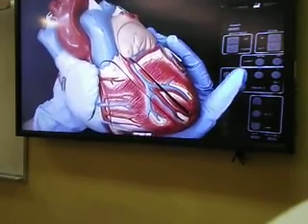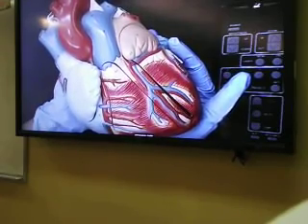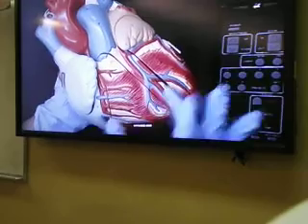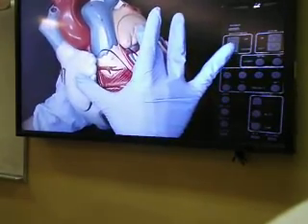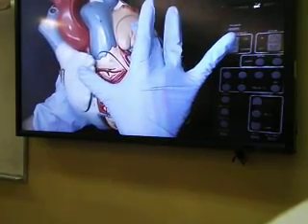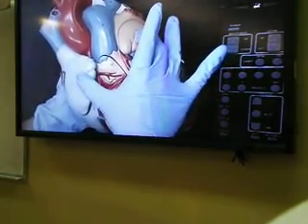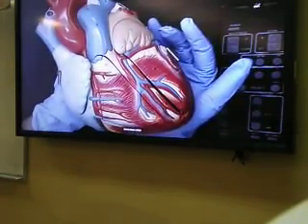After that, we want to understand what the four chambers of the heart are. All mammalian hearts, including our sheep's, have four chambers. Two chambers are upper chambers and two chambers are lower chambers. The upper chambers we call atria, and an atrium receives blood via veins. So always remember, the two atria, which are the upper chambers of the heart, receive blood via veins.